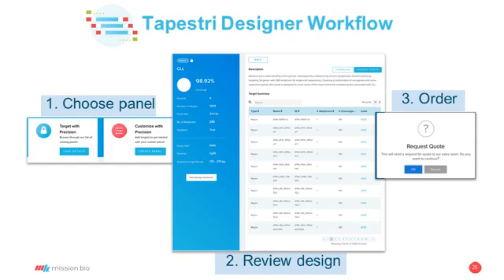There's a downloadable zip file with all of the data available if you're bioinformatically inclined to go and look at that on your own. We also have a link directly to the UC Santa Cruz web browser, so you can look at all of these specific amplicons that we've designed in the context of all of the other annotation that the UC Santa Cruz browser enables.